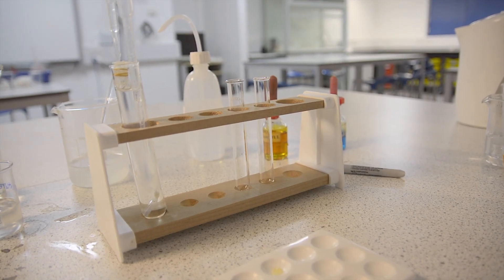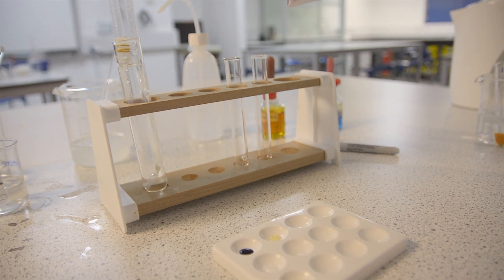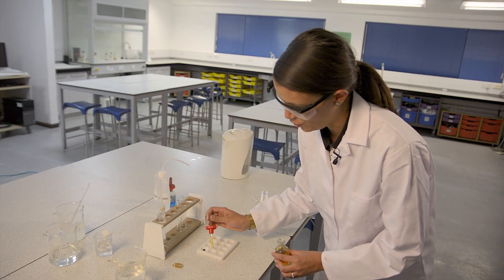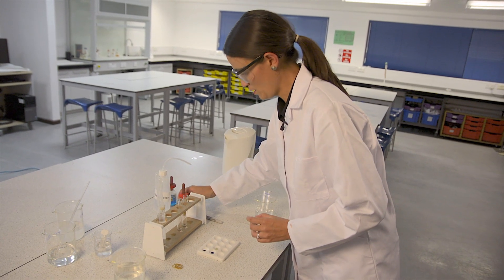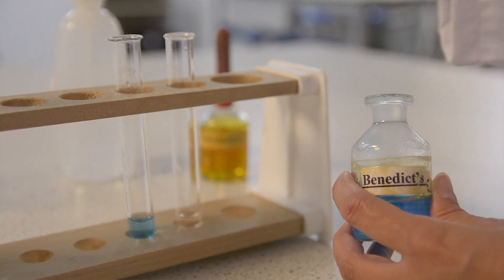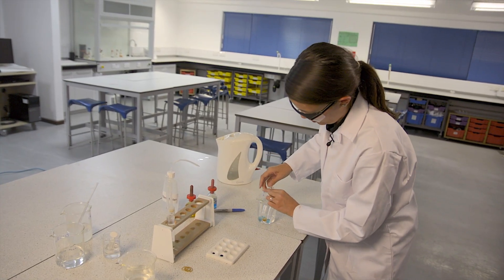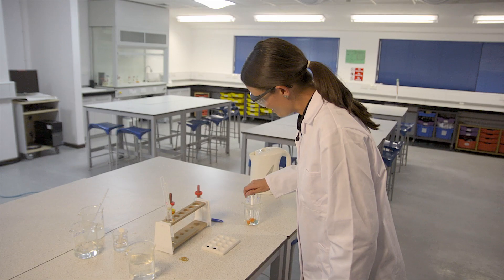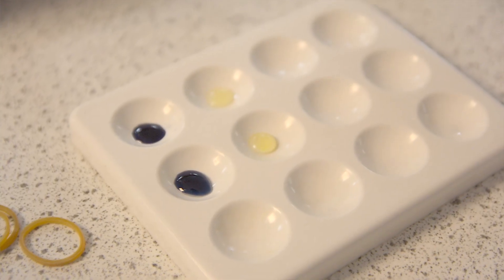After enough time has passed, you're ready for the second round of tests. I'm going to take a sample from inside the visking tubing and a sample from the water surrounding the tubing. You could ask your students to make a prediction at this stage. Testing for starch with iodine, we can see it's still present inside the tubing, but not present outside the tubing. Now testing for glucose with Benedict's reagent, the tests should show clearly that glucose is present both inside and outside the visking tubing, but starch is only present inside the tubing.